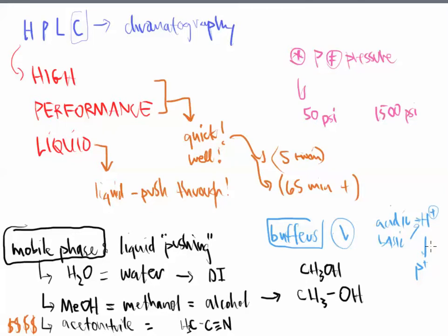In our lab, through our instrumentation training, you will see water, acetonitrile, or methanol being used for that purpose. But there are others. Just be prepared, and don't let it surprise you if you see them in any chemical literature. All right, so that's the story with the mobile phase.